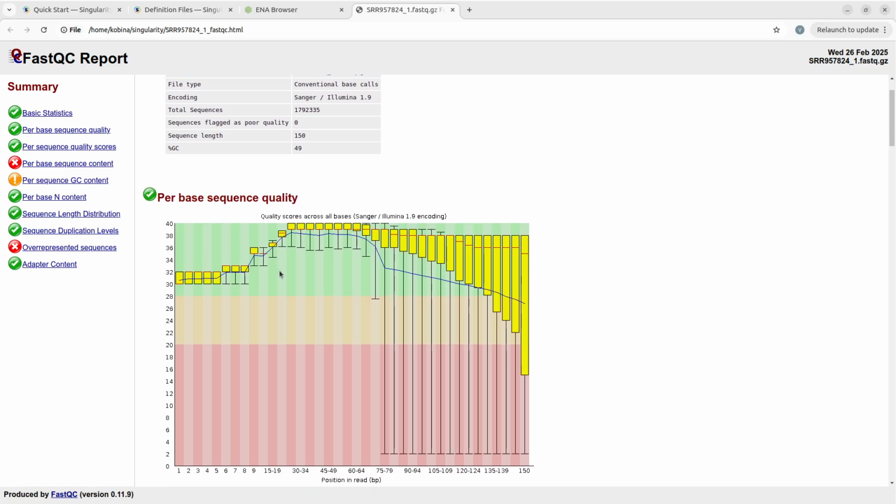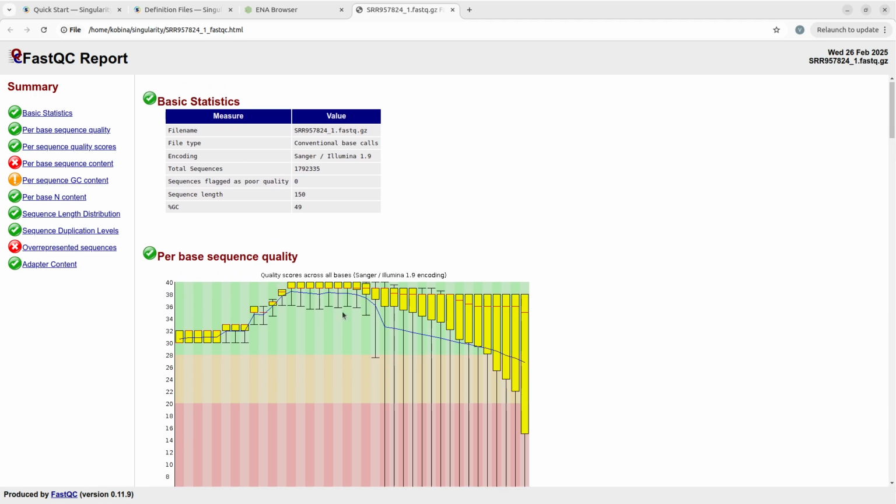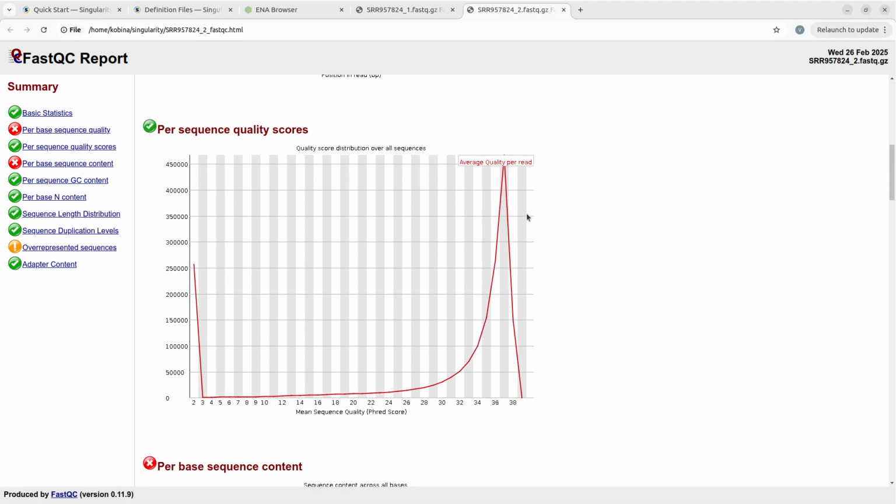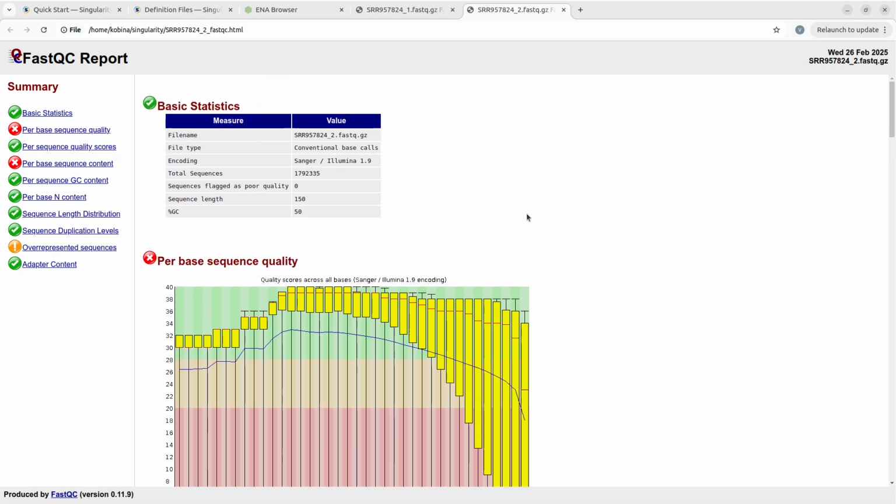Here we see that the reads are okay, but we still have some reads which have low quality at the ends. This is Illumina read, and this is a typical characteristic of Illumina reads. This is for read 1. Now read 2, the report is here. You can also open that and get it sorted out, or read on it.